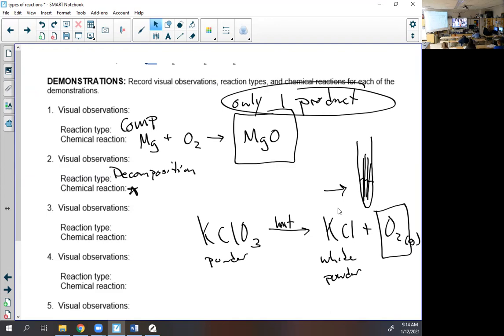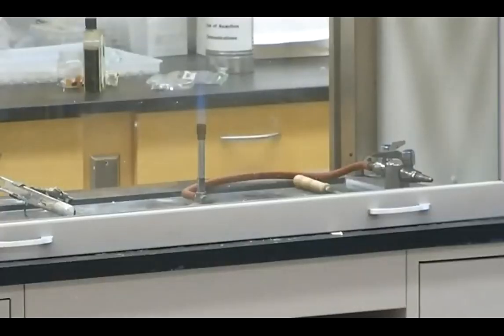All right. So you are welcome to come back by the fume hood. You're welcome to watch it from the TV. I'm going to zoom the camera in. Let me stop share. Just don't be right where Ethan's head is. That's okay. So you'll see the angle that you don't want to block.